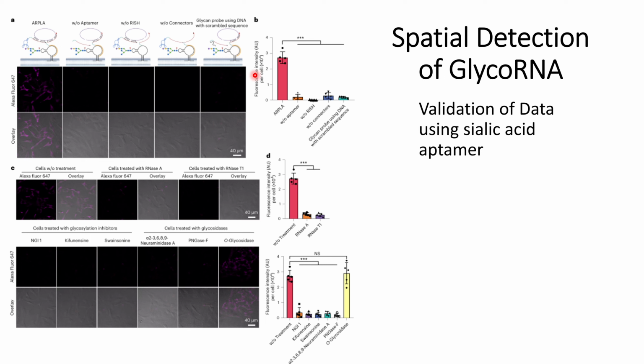The quantitative analysis of this figure is shown in panel B. We can see that the signals from ARPLA are significantly higher than the other control conditions.